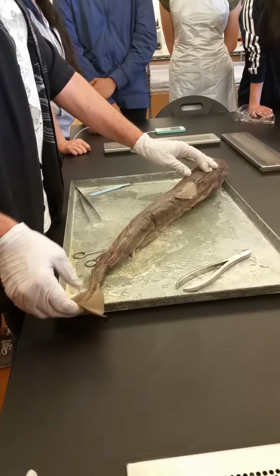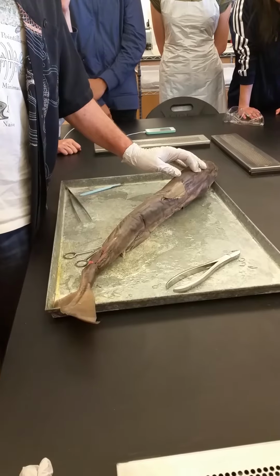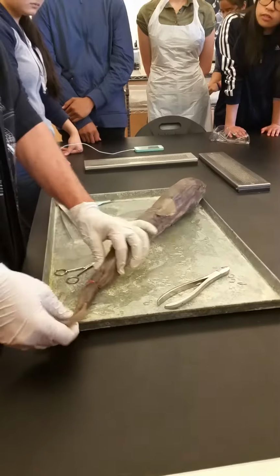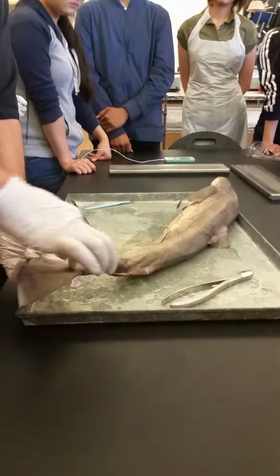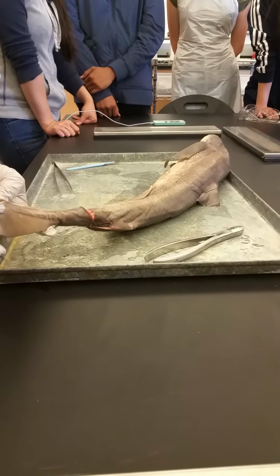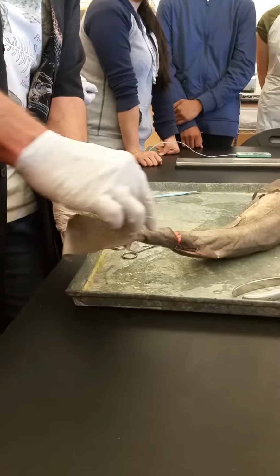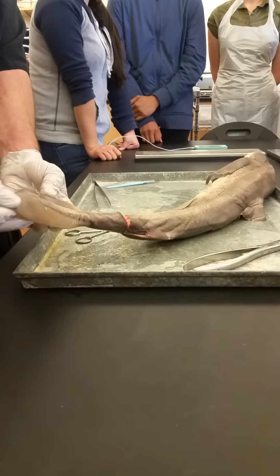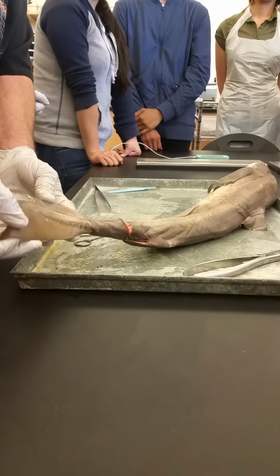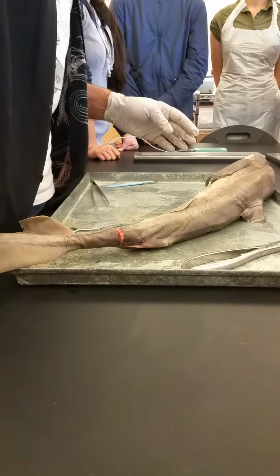Another difference between sharks and the bony fish, again the bony fish, the caudal fin comes off the posterior end of the caudal peduncle of the rest of the body. Right? So the body ends and the tail begins. Whereas in the sharks, the caudal fin is actually surrounding the tail. So here's the body. You can see the body coming all the way up here into the upper lobe of the tail fin. So the tail fin is actually coming off both the dorsal and ventral sides of the body itself. And so you end up with this asymmetrical tail, where the upper lobe is typically longer than the bottom lobe. And that gives them a lot of thrust, but as a result, it tends to pitch them nose down.